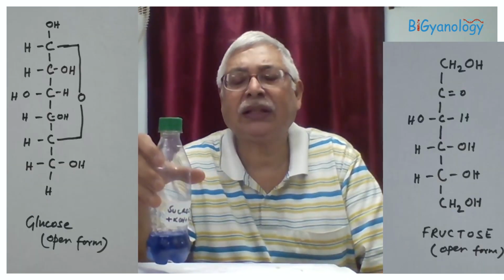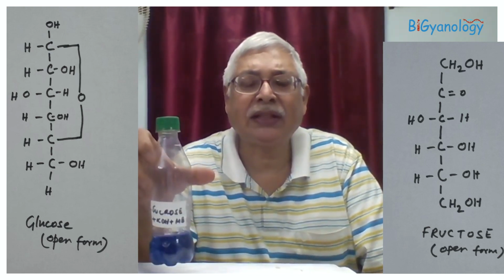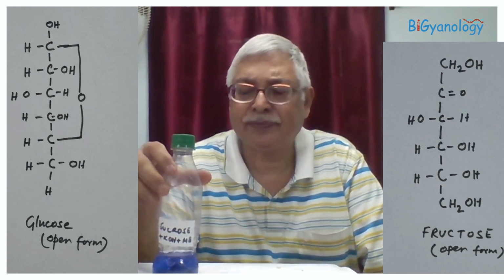Within 2 minutes this has happened. Previously I found it's 5 minutes or whatever. Now when we shake, this also becomes blue. So this also acts as a clock reaction. When we do it from sucrose, this does not react with KOH, but sucrose breaks down in water into glucose and fructose. So this can act as a reducing sugar as well.